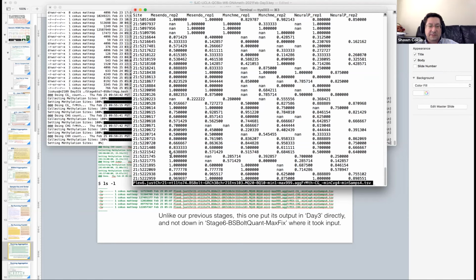Some guys, yeah, there's a guy missing one, right? And the way it indicates missing data is NaN, not a number. The IEEE 754 floating point has many reserved patterns for not a number. It's typically used as the missing data marker in C-like programs. In R, you're probably familiar with NA, which is R's favorite missing data marker.